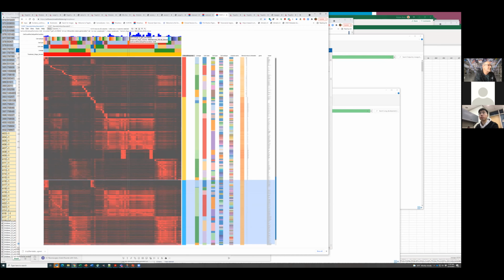Look at all of these cells that are coming up as very abundant in the steroid treated versus the steroid untreated, and then what are all these genes that are turned on? What are all these genes that are turned off? And there's something different going on between the myeloid and the lymphoid cells as well. Something very different. So just to unravel it a tiny bit, this is an amazing thing.